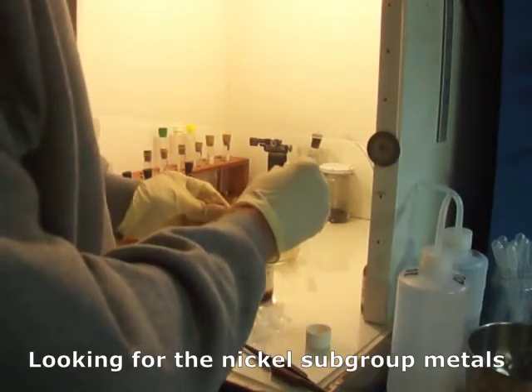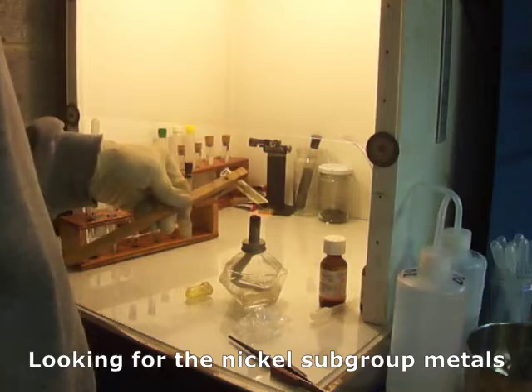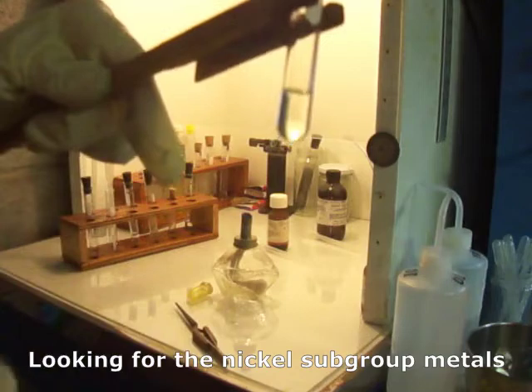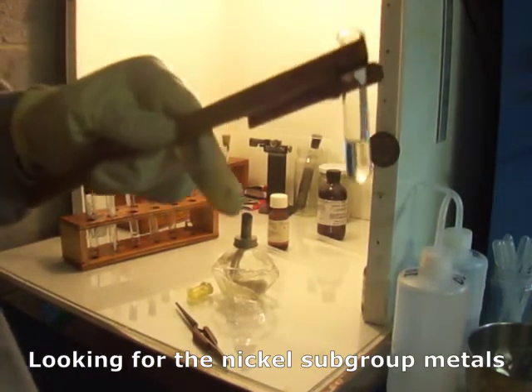So let's get started. We add 10 drops of concentrated hydrochloric acid and boil gently for a half a minute. Everything dissolved, and I added 10 drops of cold water. Now we're supposed to centrifuge to get out any sulfur, but it's totally clear, so we're going to skip that.